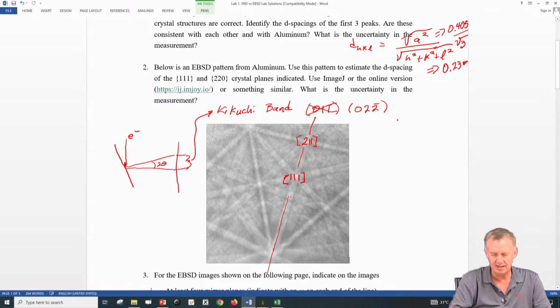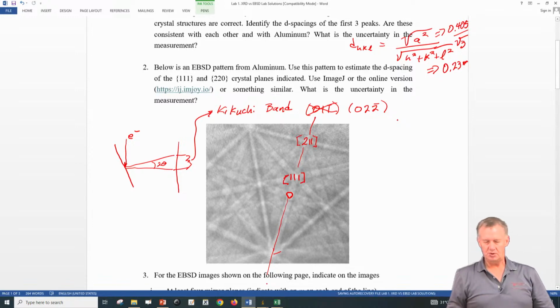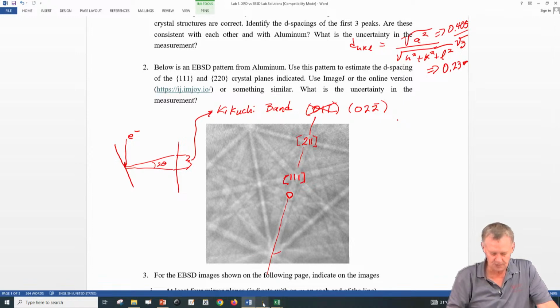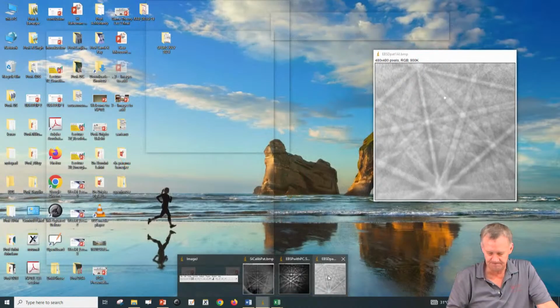And this little zone axis down here, right there, that's going to be a 233 type, just because I know what the diffraction does, right? And then we have another 011 down here that is going to be an 011. Okay, but all of that doesn't matter. So we know that is 02 2 bar. Okay, so let's go back here.